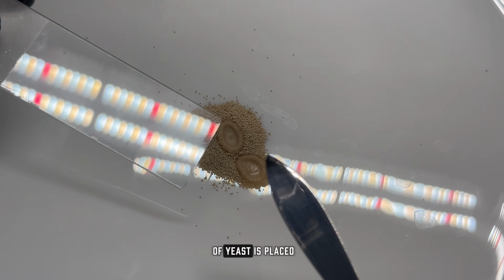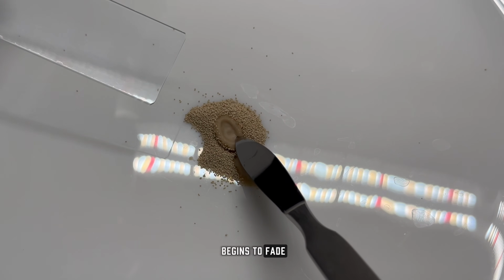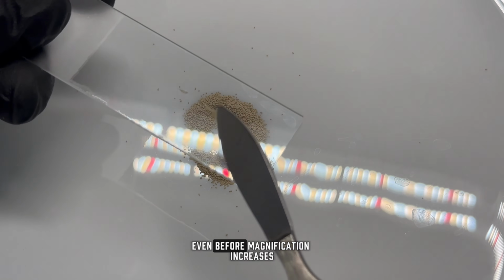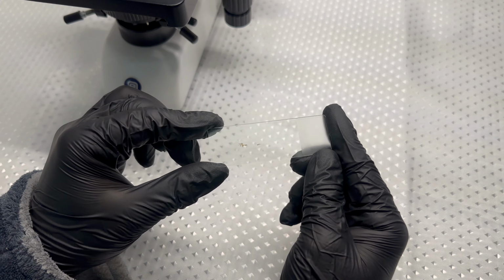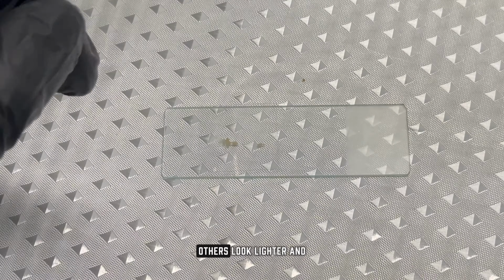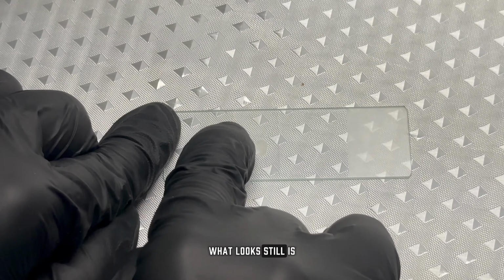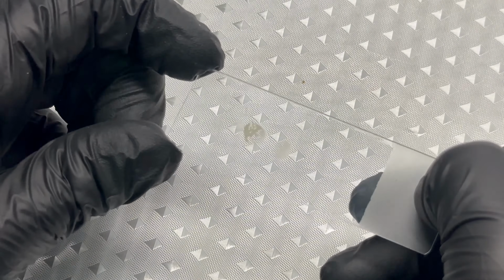When a small amount of yeast is placed onto the microscope slide, that sense of simplicity begins to fade. The familiar idea of yeast as just an ingredient starts to dissolve. Even before magnification increases, the material already shows variation. Some areas appear denser and more concentrated. Others look lighter and more dispersed. The surface is not as uniform as it first seemed. What looks still is not truly inactive. What feels dry is not lifeless.